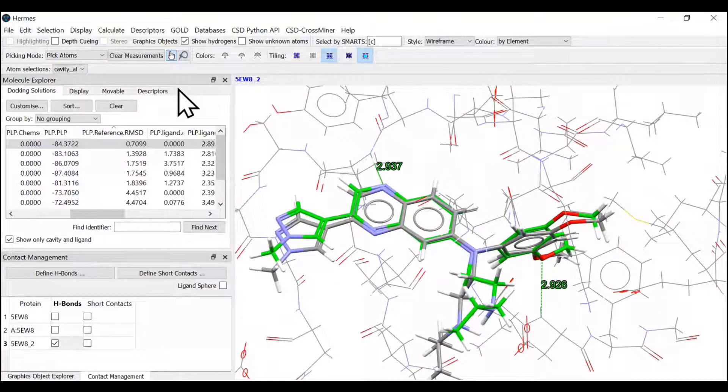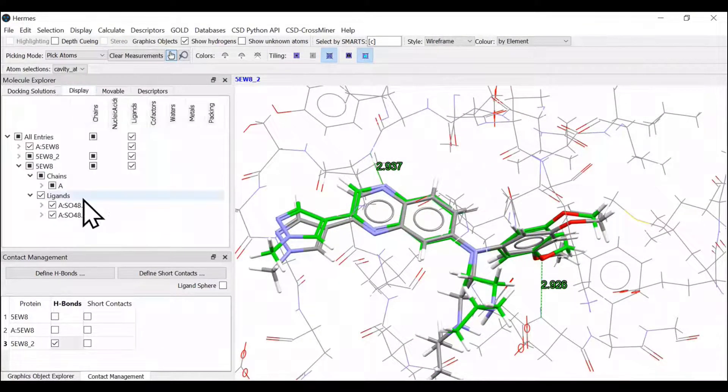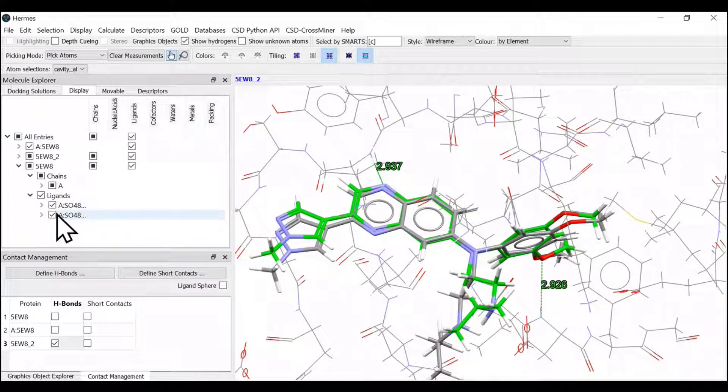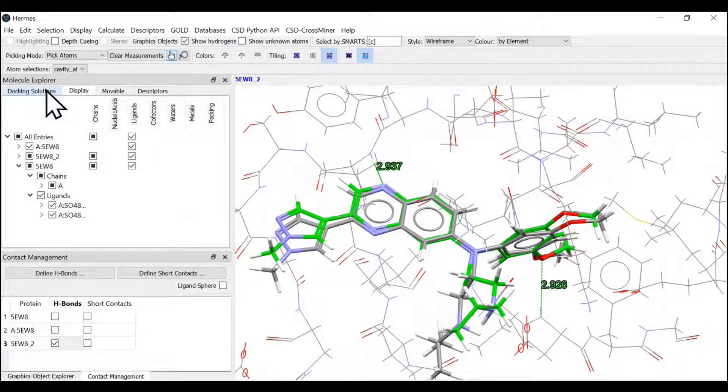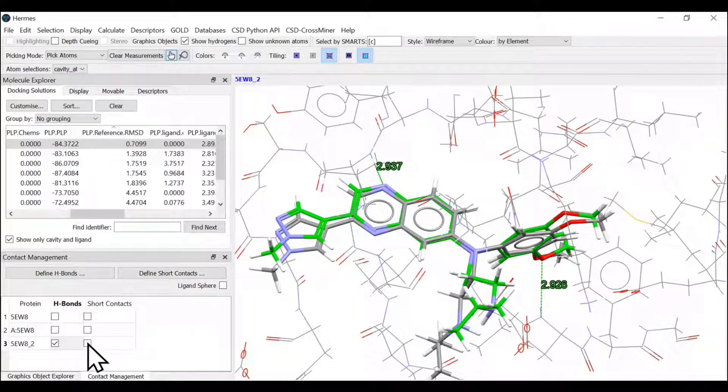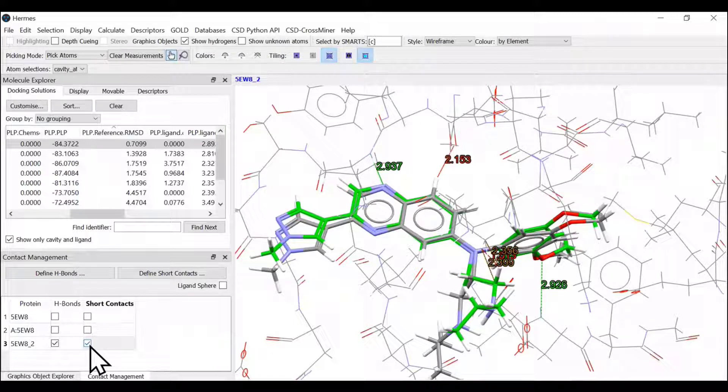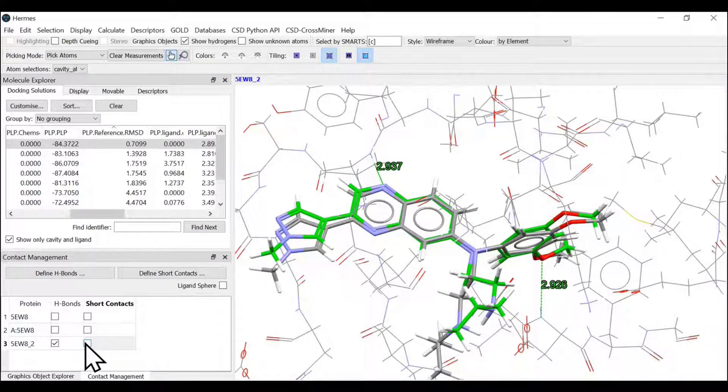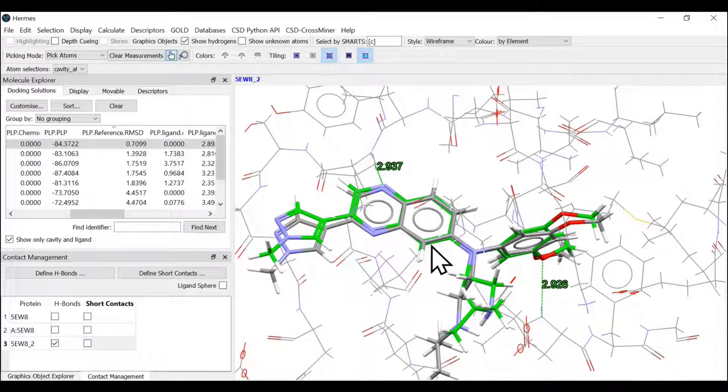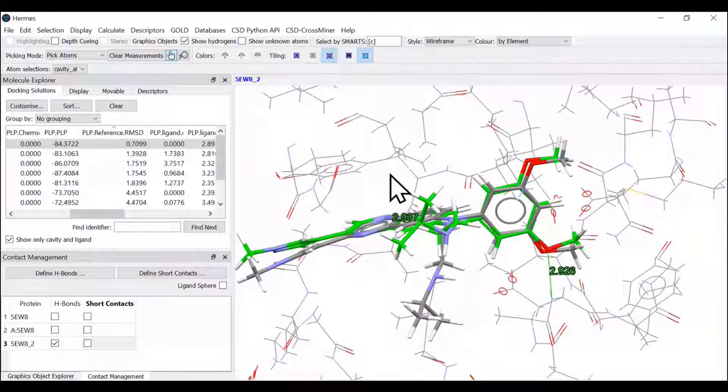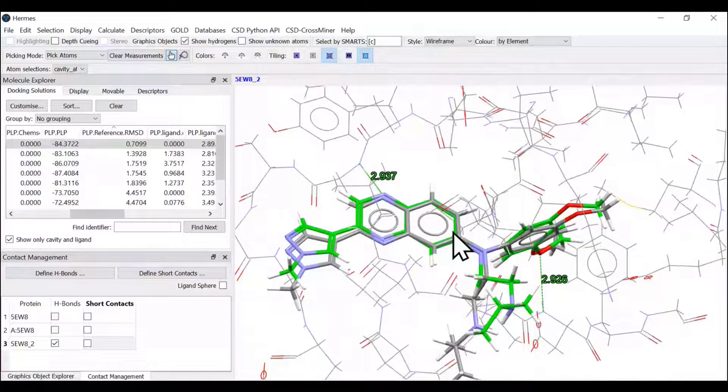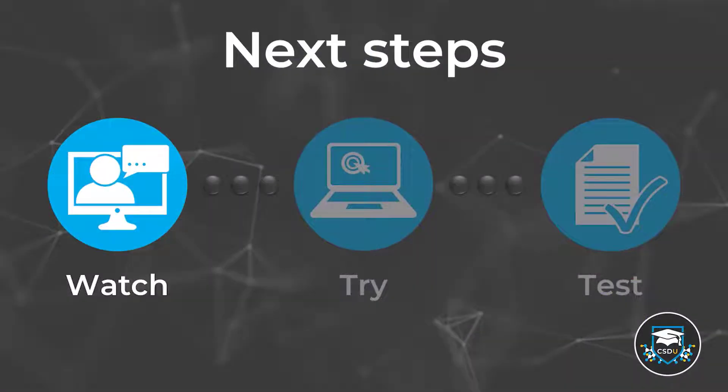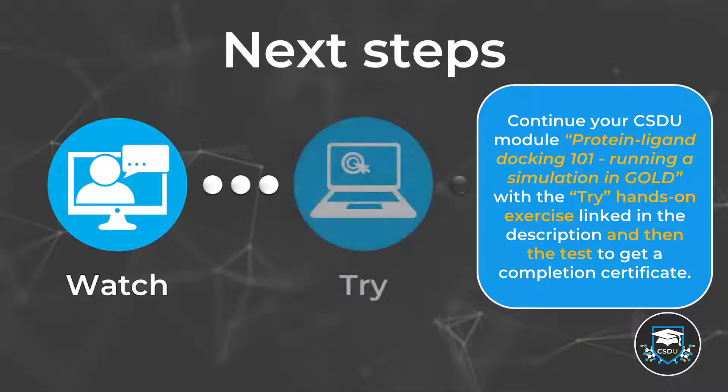In the display option, you can explore or see what various features are being displayed on the interface. You can also look for short contacts and so on. This is how you perform docking in GOLD. This is an example for beginners.